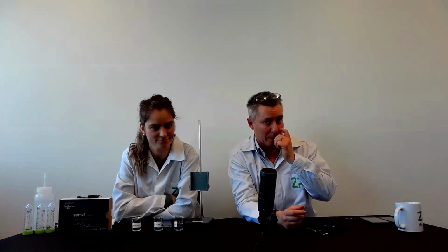We've been using it to measure things like conductivity of soil. Just a side point, but the most knowledgeable person in our company on conductivity and impedance spectroscopy is behind the camera, so he's hiding there. But I just want to put a shout out to Mots. But the quick answer is the gold 303. If you Google that, you'll find an electrode that we can stand behind, and it works pretty well.